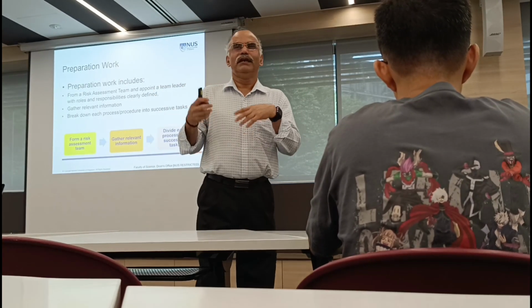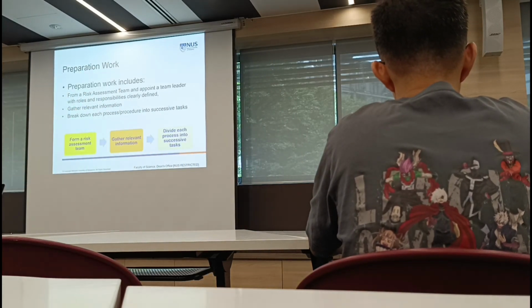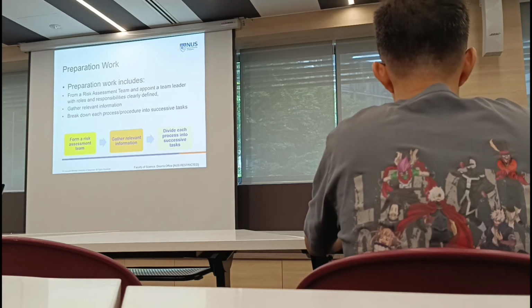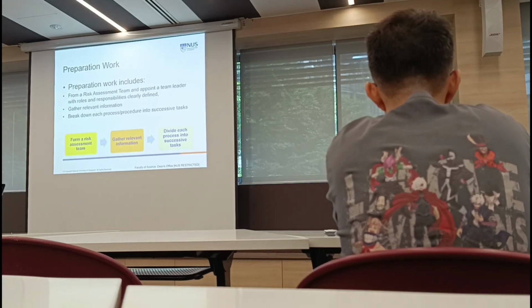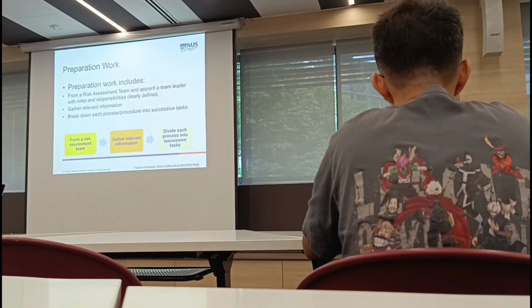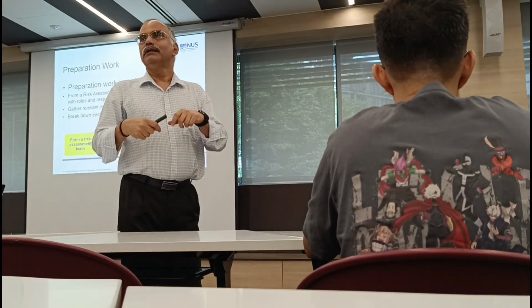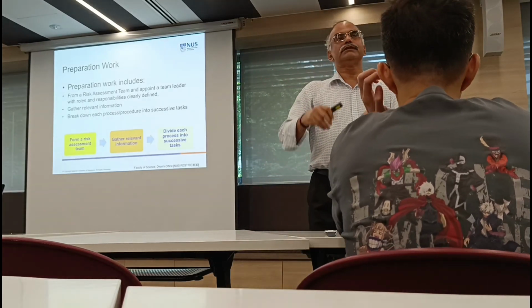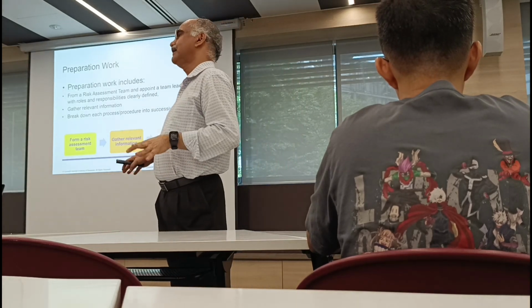In a research group, I don't think a bunch of you will come together and discuss your research, your experiment, right? But what you should do is talk to your supervisor, talk to your seniors who have done similar reactions, or whoever is available, or maybe a postdoc who has more experience than you, and say, yes, I have to do this experiment, or there is a procedure here, these are things involved, and how do I do it? Just sit down and talk to that person, right? And then break down the process and procedure into multiple small steps. Don't think about just a one step process. It's never one step, right?